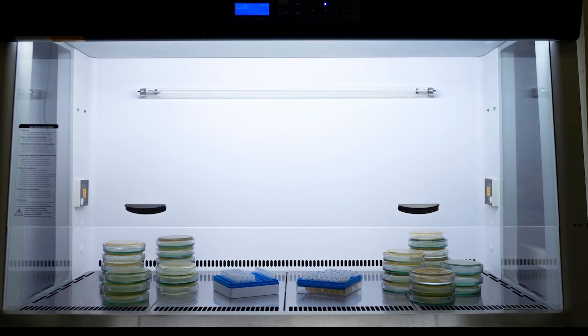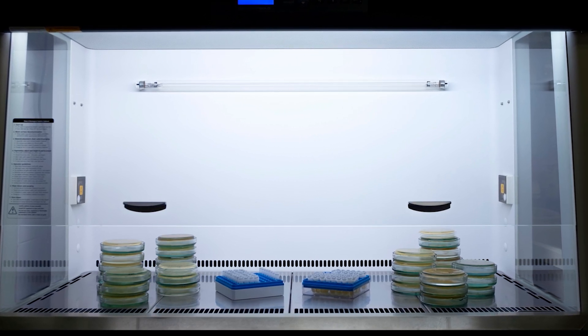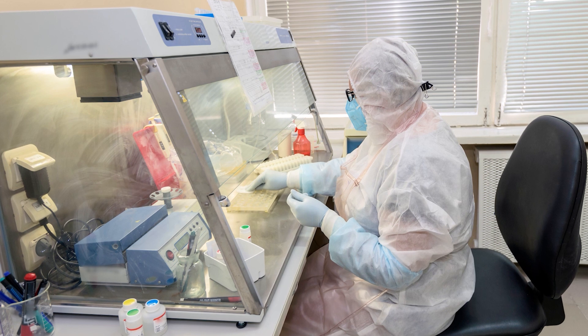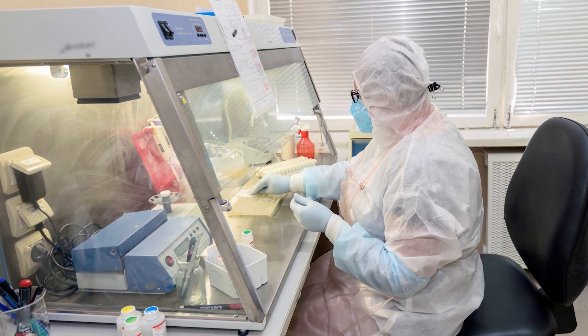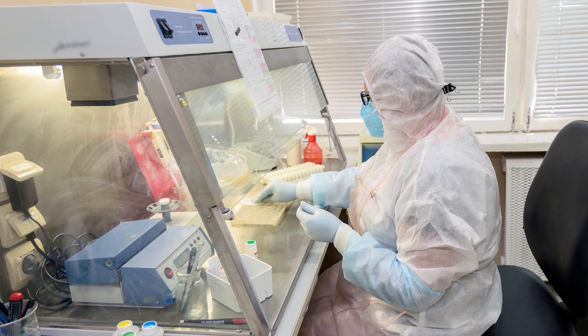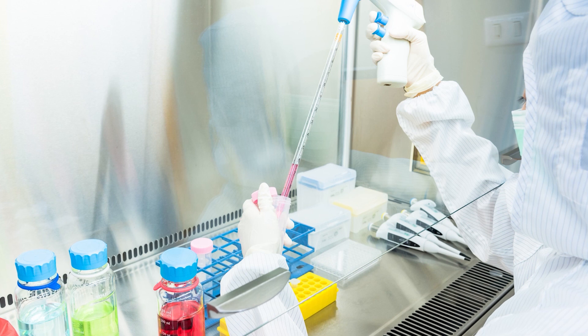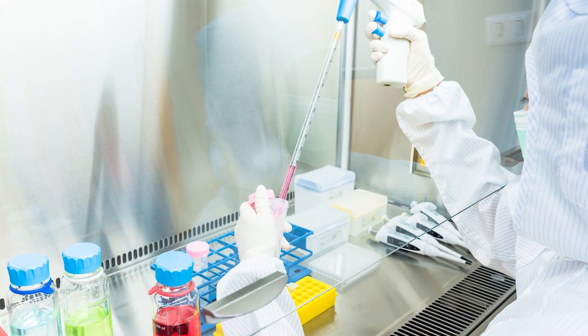Amidst all these components, the sash is one of the most important parts of the fume hood, and its height has significant implications for both safety and performance in the laboratory setting. Properly adjusting the sash helps to maintain an optimal face velocity, which is essential for capturing and directing contaminants away from the user.